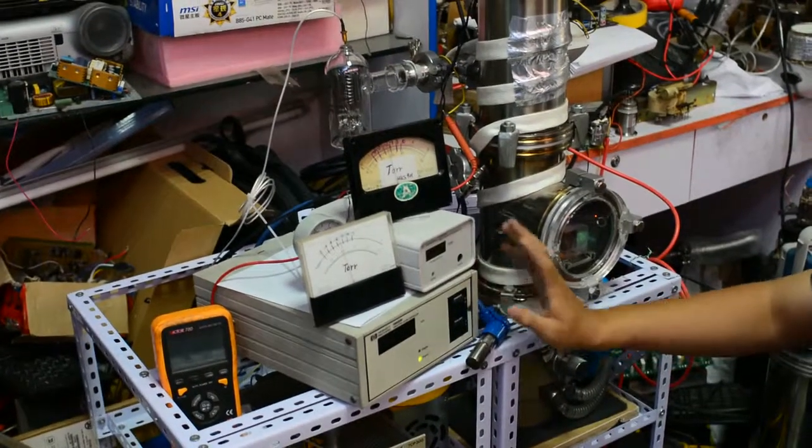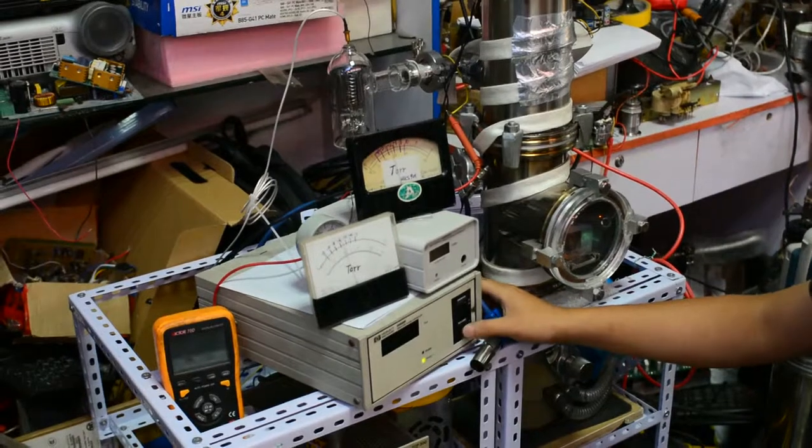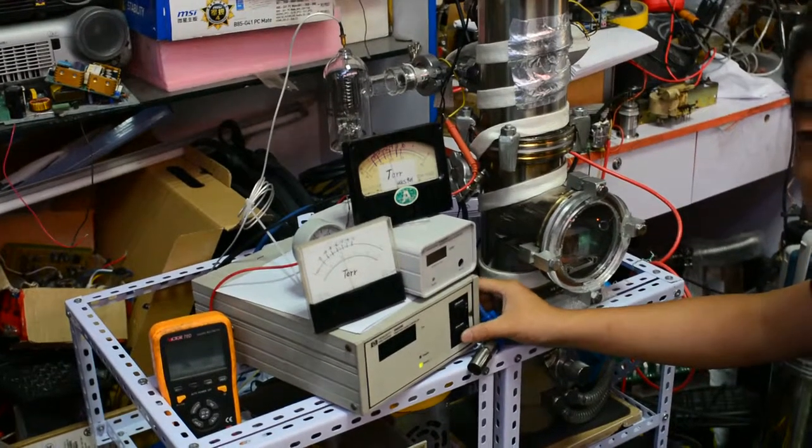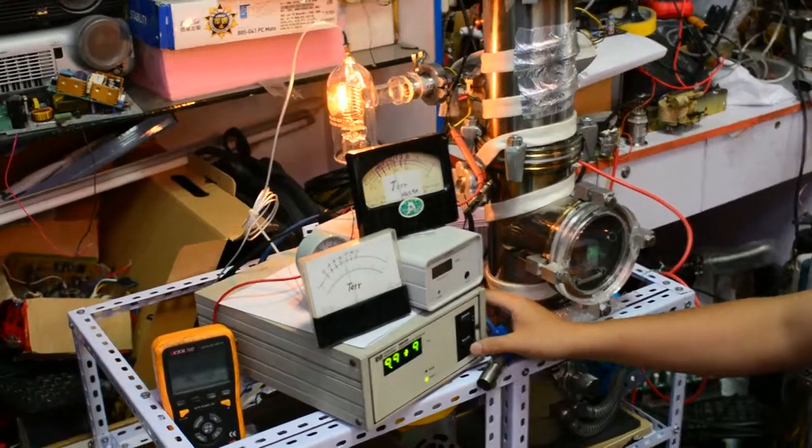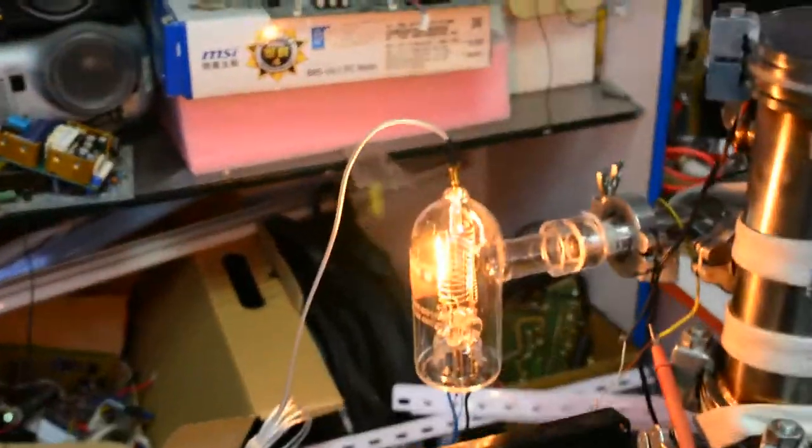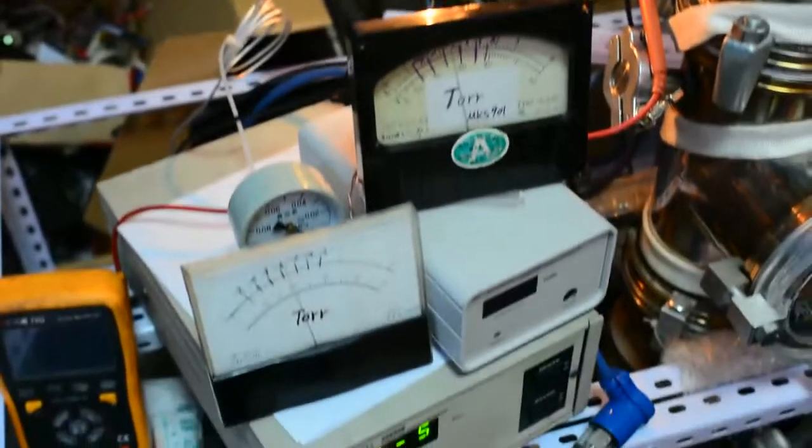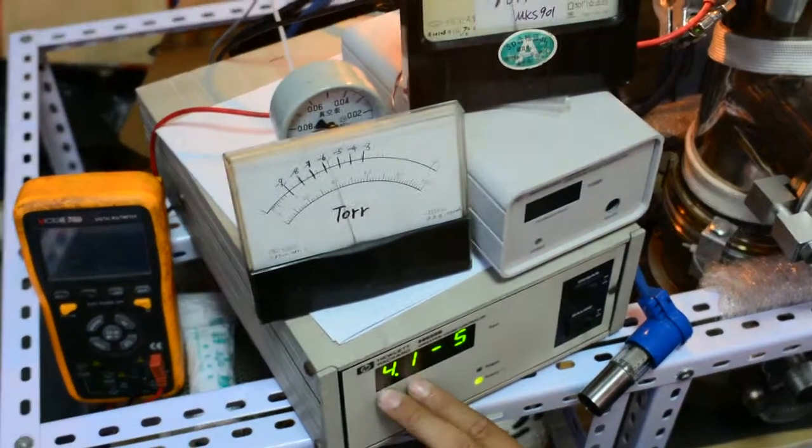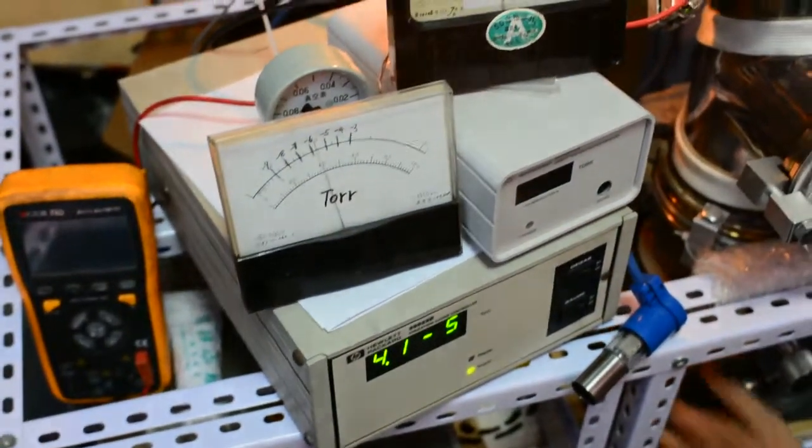Now it is cooling down. I can turn on the ion gauge again. You can see the vacuum level is rising up a little bit, but it is dropping down because the turbo-molecular pump is running.